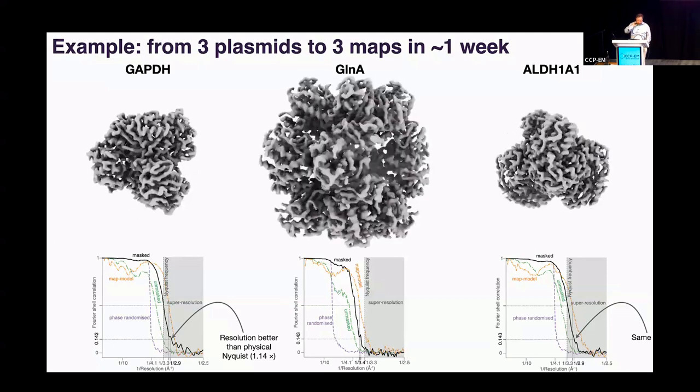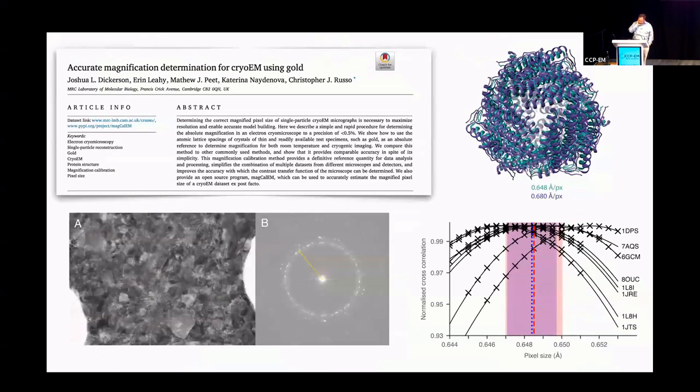And we've been looking at this recently, and it turns out that I'm pretty sure a lot of the magnifications that have been used for structure determination in the cryo-EM field are probably wrong to some significant degree. And other people have observed this as well, especially Takanori, from Chora's group, who's now back in Japan, who has really championed the idea that this needs to be sorted out. But we were keen to find a way that you could actually check magnification without having to do an apoferritin structure, for example.